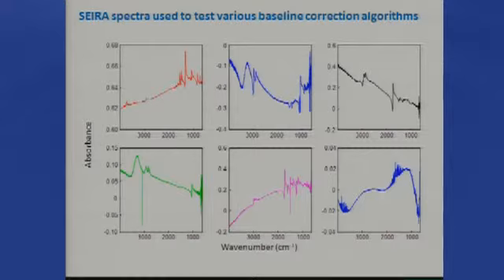Sometimes we even found ones with really large negative going spikes in the middle of the spectrum like this, as opposed to the outer limits where we could ignore it. This last one here looks like just a bad baseline and a bunch of water vapor on there.